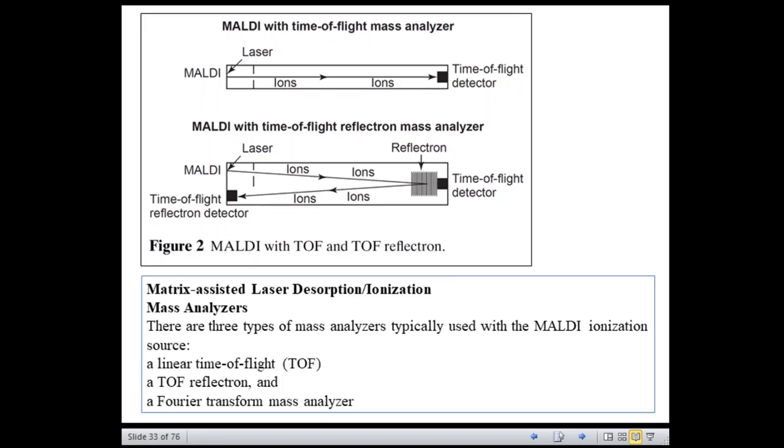So 3 important points are considered when the ion reaches the detector. That is the arrival time. Each ion touches the detector point with relevance to 3 important features, which are the mass, the charge, and the kinetic energy.